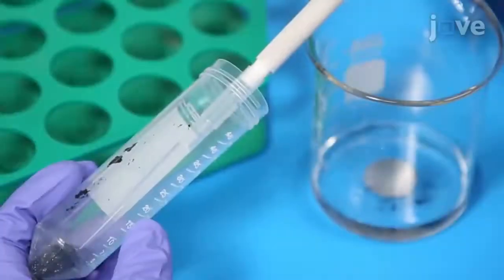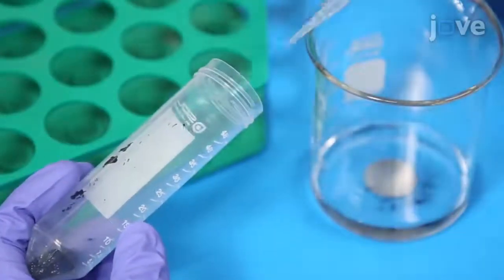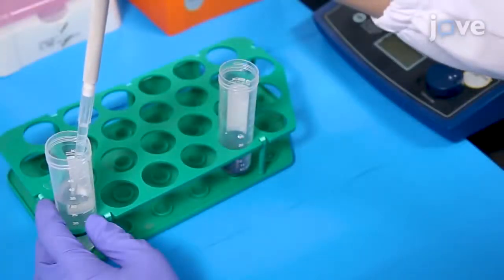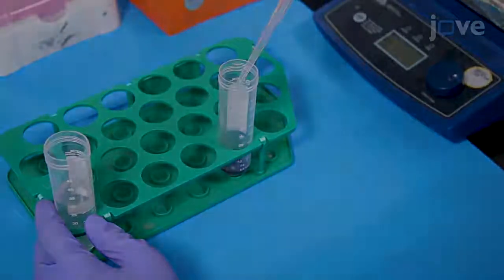Remove the supernatant with a pipette equipped with a 1 milliliter pipette tip. Add 5 milliliters of ethanol to the solid and rinse the walls of the vial with additional ethanol.